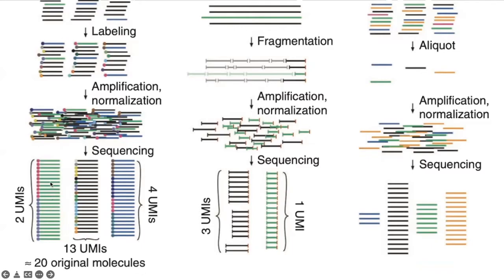You're going to say, well, this gene is really highly expressed, and it's even higher expressed than the black gene. But actually, if, for example, your PCR just over-amplified this green gene, you have a problem. You are being biased. You are seeing something that actually doesn't exist.